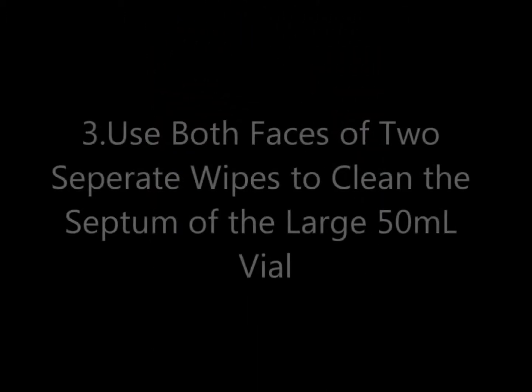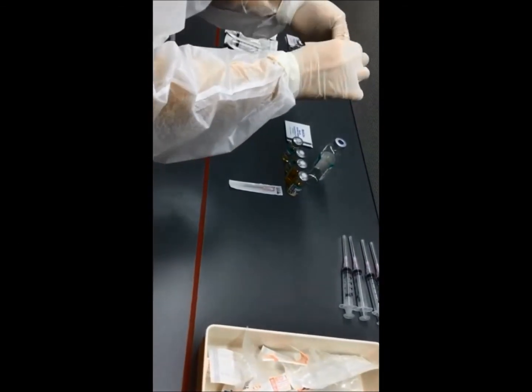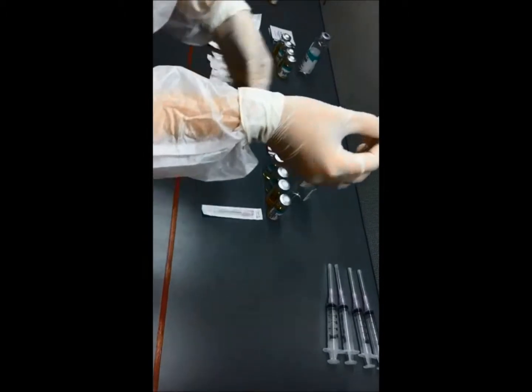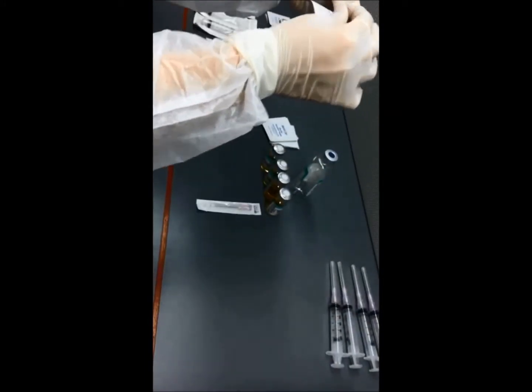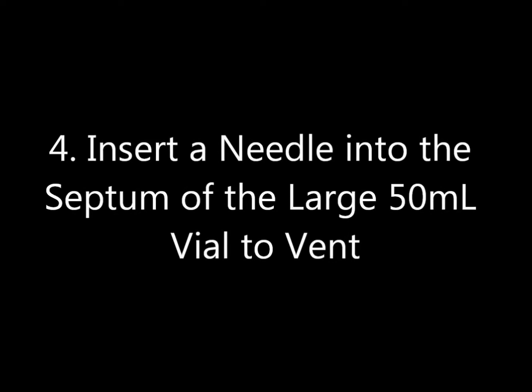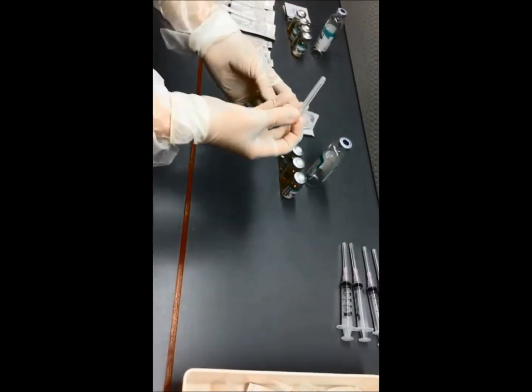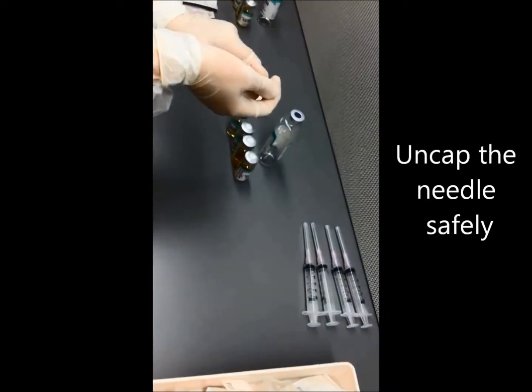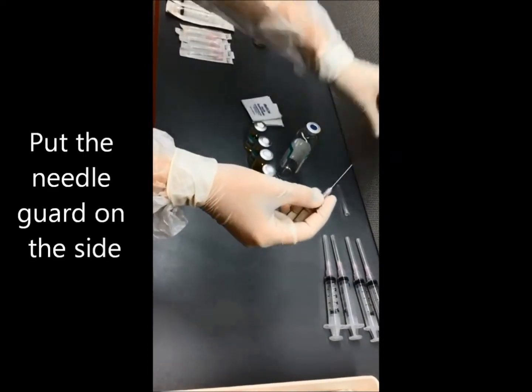Number three: use both faces of two separate wipes to clean the septum of the large 50 milliliter vial. Number four: insert a needle into the septum of the large 50 milliliter vial to vent, and cap the needle safely. Put the needle guard on the side.